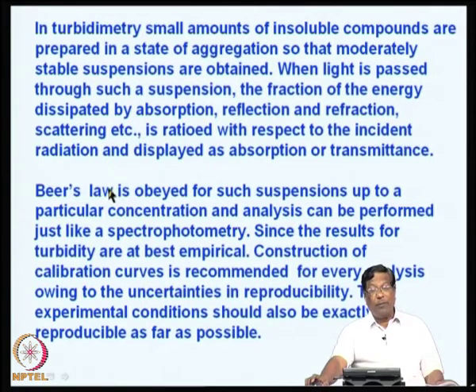Now, for any quantitative analysis, Beer's law must be obeyed, and if Beer's law is not obeyed, you cannot have a quantitative determination. So, for such suspensions, Beer's law is obeyed only up to a very small concentration, and analysis can be performed just like spectrophotometry.